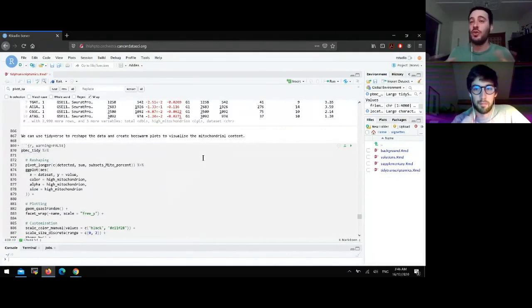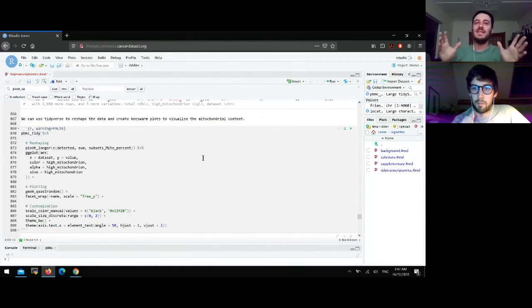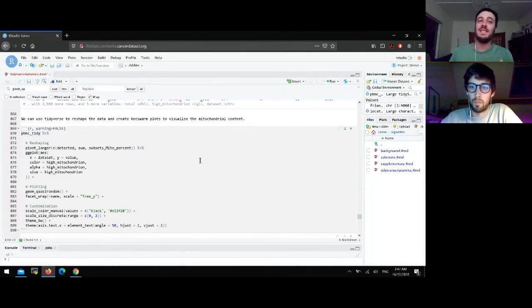One thing we can do normally, forgetting about tidyverse, when we do quality control, is to plot, for example, a density plot or violin plots about our distribution of, for example, mitochondrial information. And there are plenty of ad hoc functions out there that can do this in one line, okay? So you get out a kind of standard plot and you can paste multiple plots together. But what if we want to get out, again, a customized plot, maybe with multiple facets? It's quite easy to build a custom plot with this table abstraction.